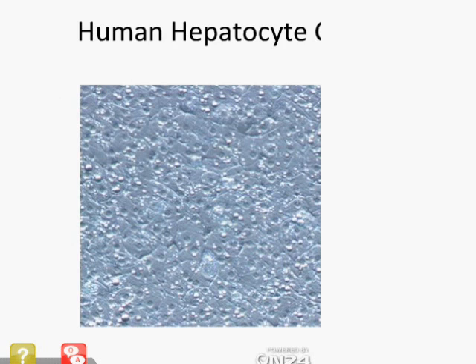Here is a picture of a culture. The image is taken from a 20x HMC optics. You can see distinct cuboidal cells forming a monolayer at nearly 100% confluence. The divots are the nuclei, while the shiny bubbles are fat droplets.